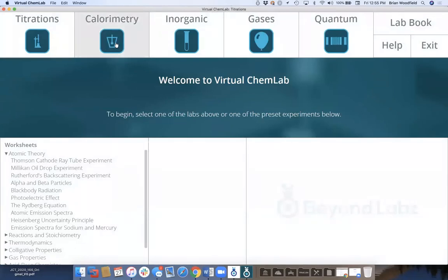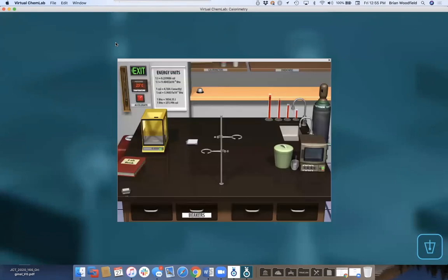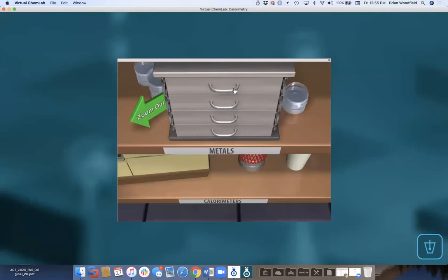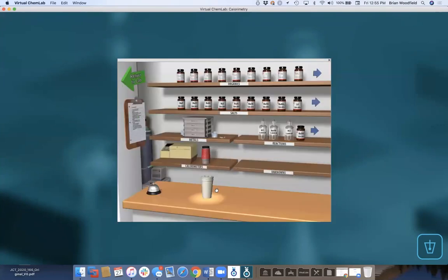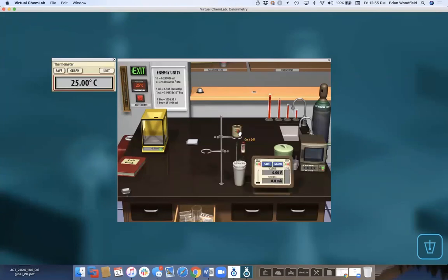Let me show you calorimetry. We have a bomb calorimeter to measure heats of combustion and heats of formation. We have Dewar and coffee cup calorimeters and drawers full of 64 different metals to measure heat capacity. Let's say I want to measure heat capacity — I drag out my coffee cup, drag out my metal, turn on my thermometer, turn on stirring, and take the lid off.